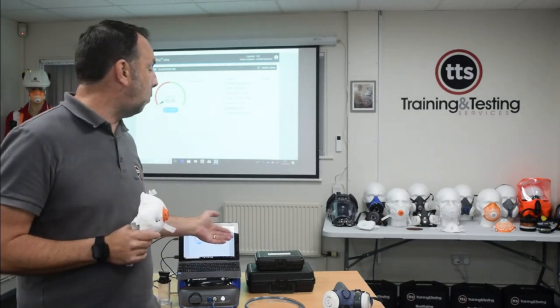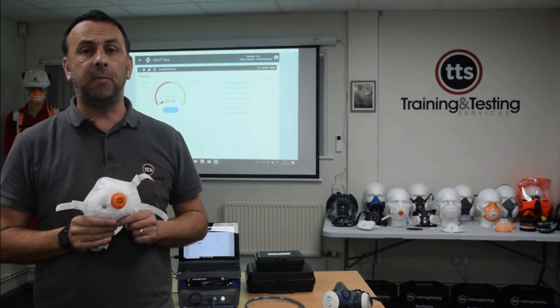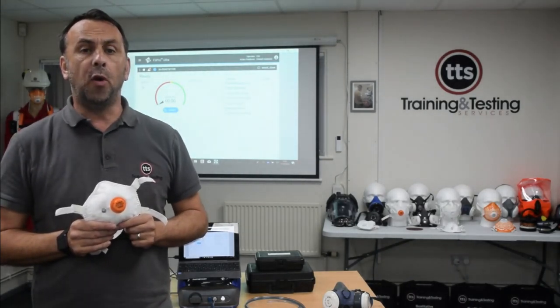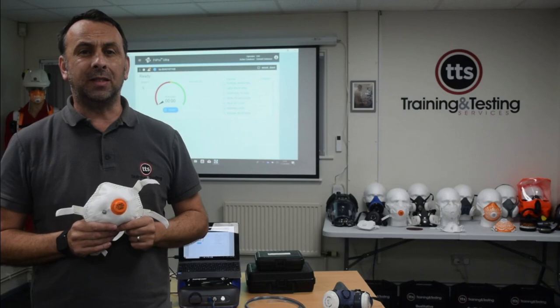The way the PortaCount works is it takes a sample of air from inside the room, it also takes a sample of air from inside the mask, and it compares the air quality between the 2 results, okay? In order for this test to pass, the mask has to pass with what we call a fit factor of 100 or more, and that is the same for any half mask respirator. Anything under 100 would be deemed a fail, and the machine will automatically tell us that.